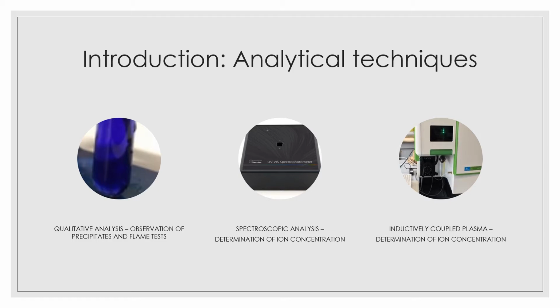To analyse our water sample, we'll be using three main techniques. The first one is qualitative analysis, and this is simply seeing a precipitate or a specific colour in a flame test. The second one is using spectroscopic analysis to determine the concentration of ions, and the third one also determines ion concentrations, however in a much different way, and this technique is called inductively coupled plasma.